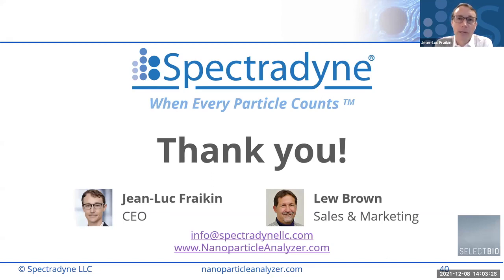So it really depends on the size range of interest. I think we have 5 different cartridge sizes that are commercially available, and they overlap. So it really just depends on your application and region of interest.